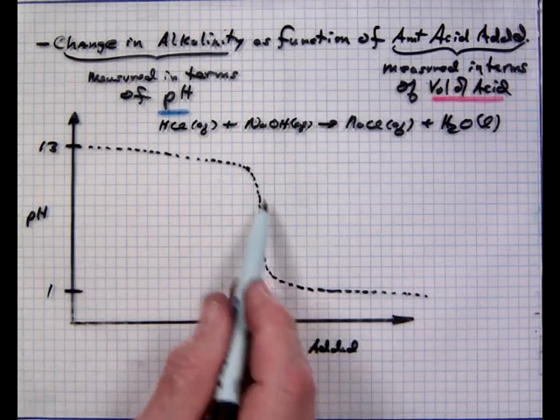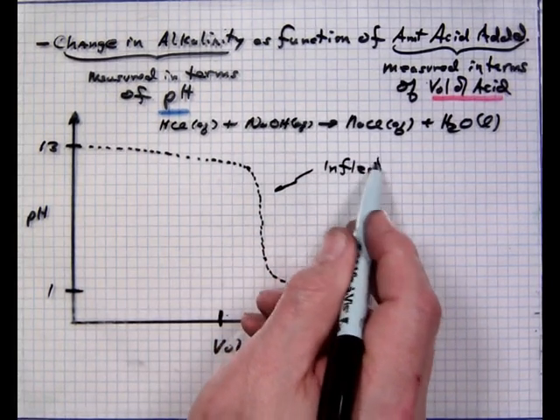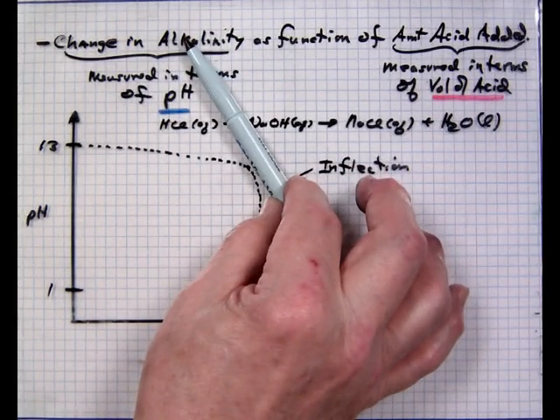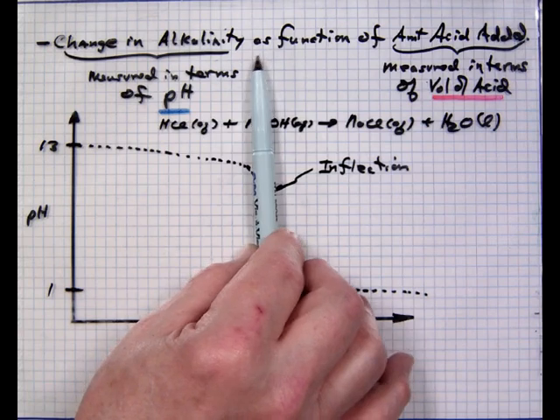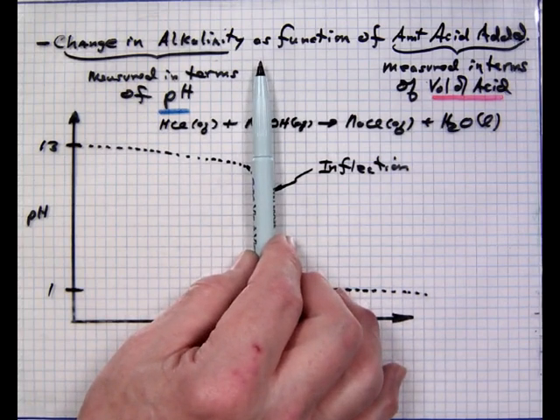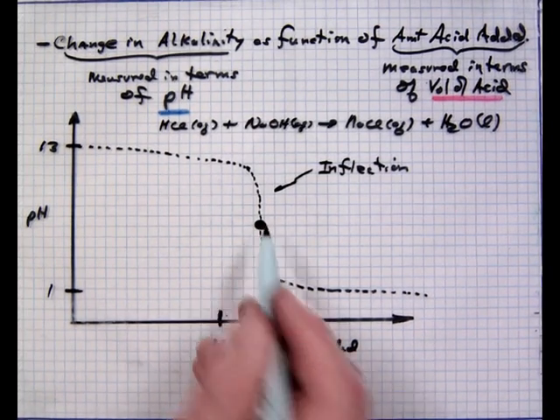The point in the middle of this inflection, which changes from a negative slope to a vertical, then back to a positive slope maybe, is what you're looking for. It's a vertical slope where the second derivative is 0. We could simply say it's, and I'm eyeballing this, say right there.